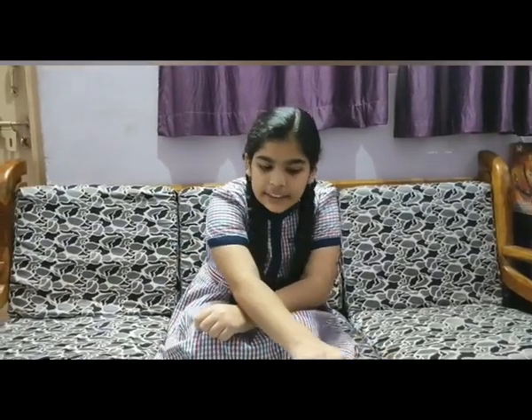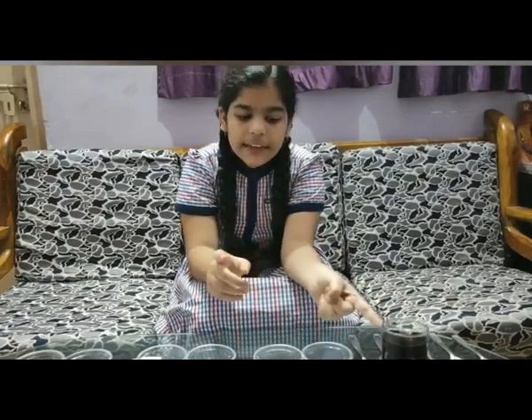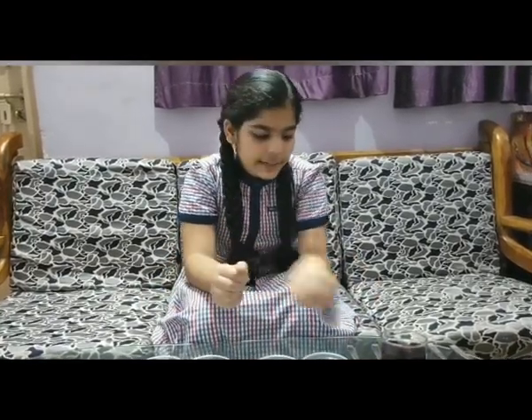Now I am ready to perform this experiment. This is the indicator and these are the substances. The question is: how will we get to know whether substances are acid, base or neutral? The answer is, China Rose gives dark pink color when added to acid, green when added to base, and no color change when added to neutral. So, let's get started.